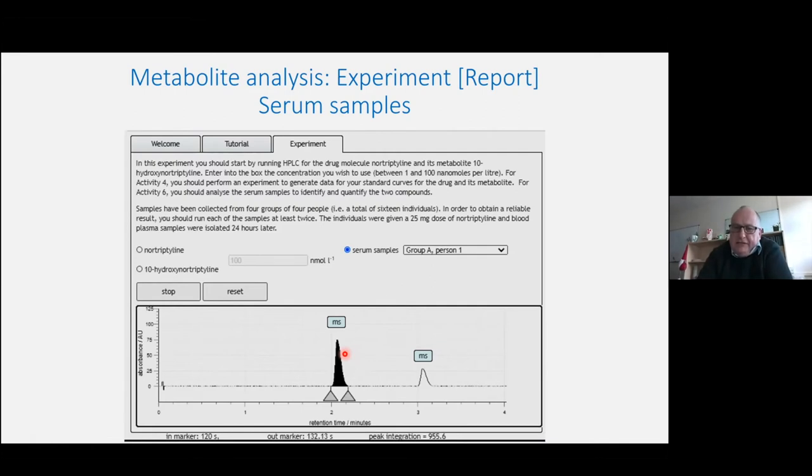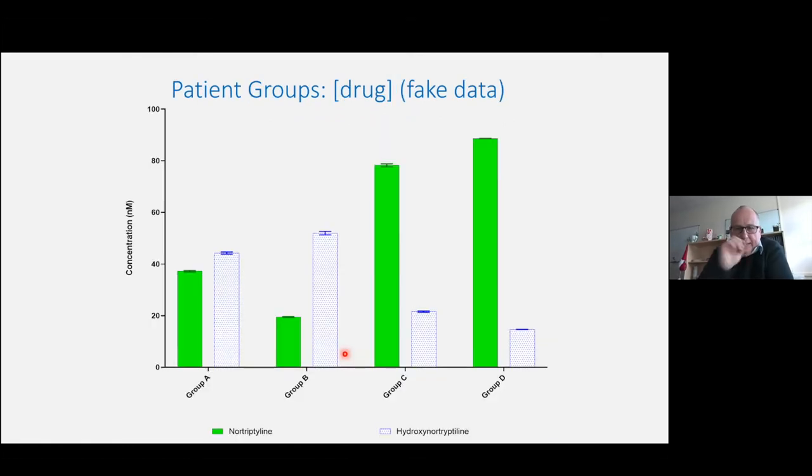So this links in really well with drug metabolism and pharmacology lectures. So they have to bring that kind of information into this practical and the report. So that's the first part. Oh yeah, then this is just the kind of data that they get.